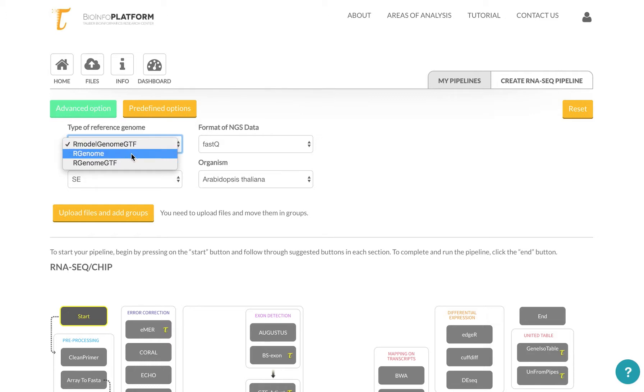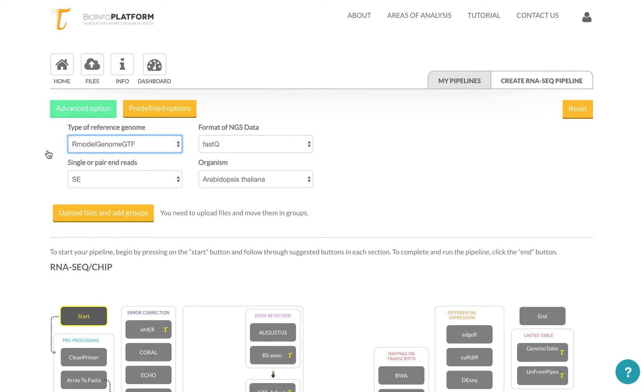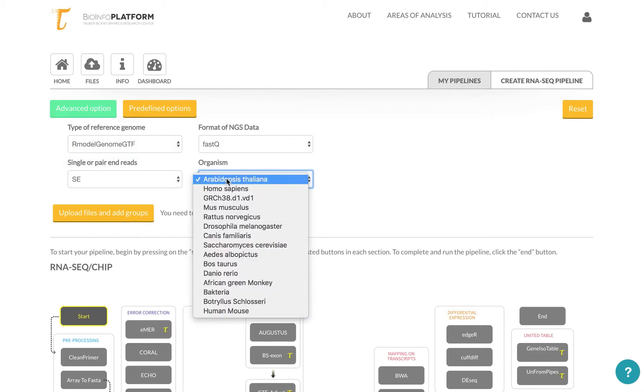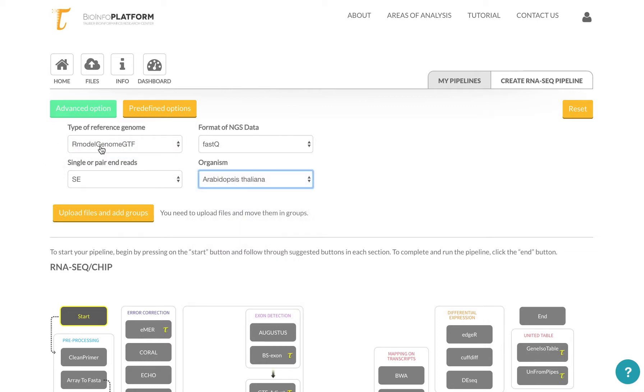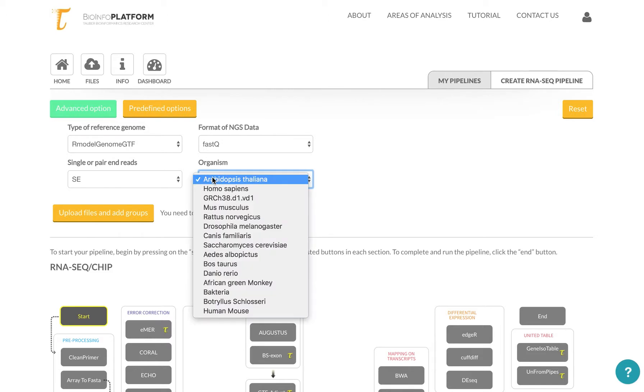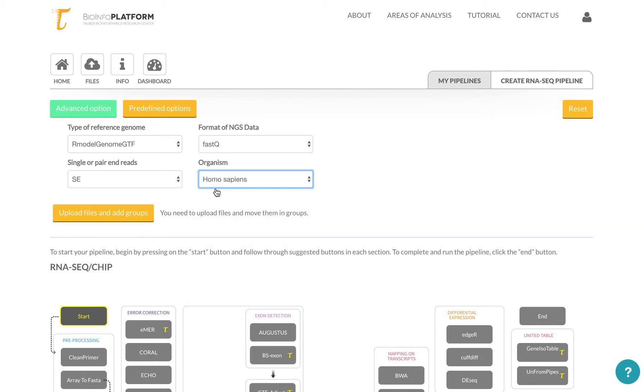Right now I'm going to use a human genome, so I'm going to select the human genome over here. Single End or Pair End, you typically know from the data whether this is PE or Pair End or Single End.